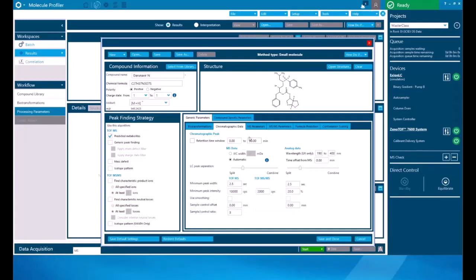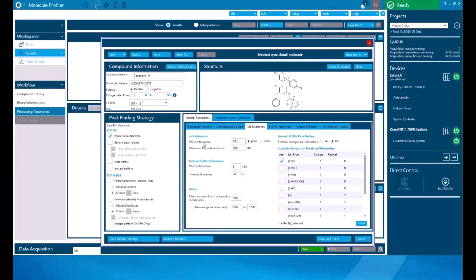for, right? For example, if I go to the MS parameter, if I click on m/z tolerance, it says type of minimum tolerance to find potential metabolites. So that means it's on the MS1 level to identify your metabolites. Same is the case with all other parameters too. And then you can also select your available adducts of the predicted metabolites, whether you're looking for ammonia adducts, sodium adducts, or just M plus H. You can pick here.